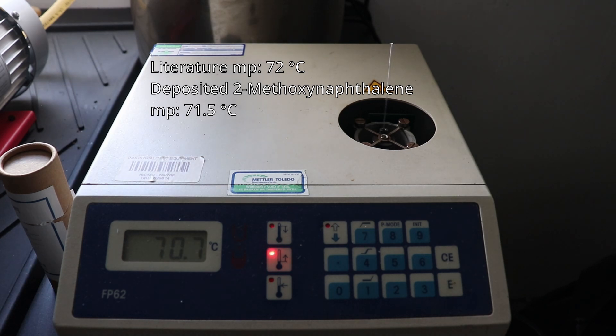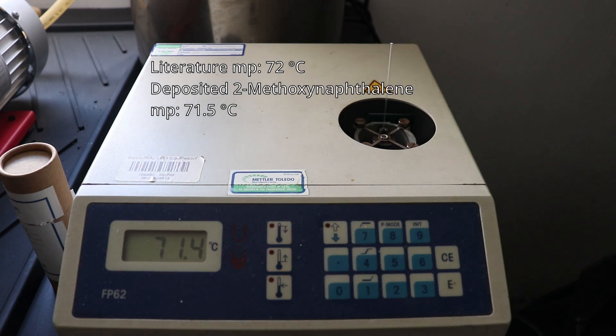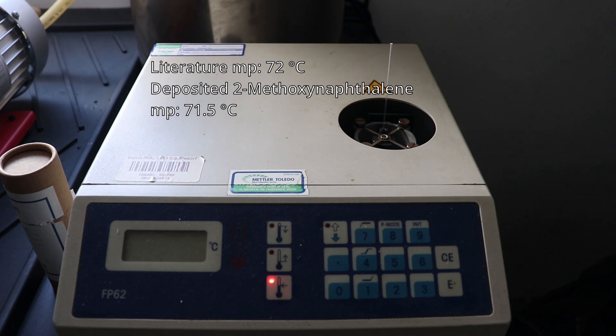And since all of these melting points are within 1 degree of the literature 72 degrees Celsius melting point, I can say with confidence that I have successfully made 2-methoxynaphthalene, which also gives evidence towards the successful preparation of 2-napthol in the previous video.